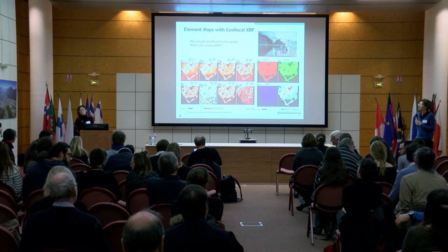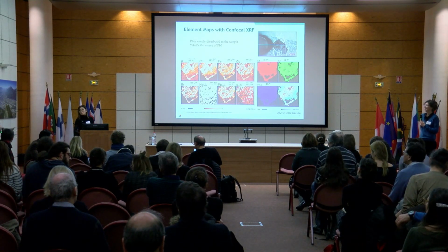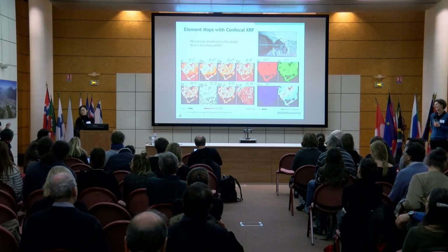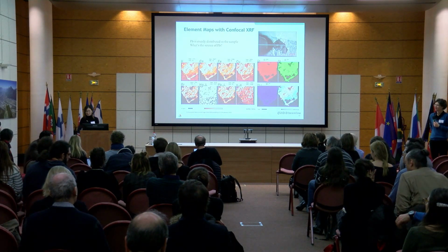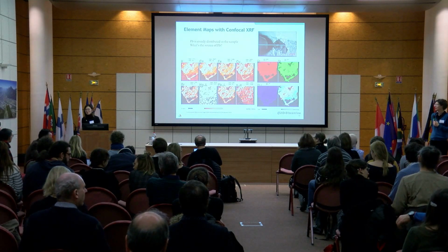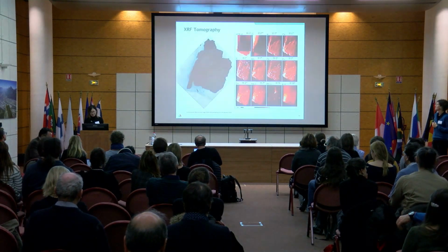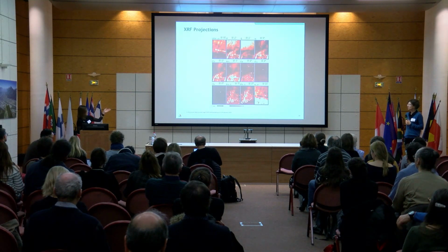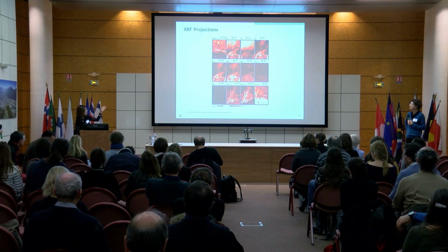It looks to me we have all possible explanations: lead everywhere, almost no contrast, a bit of lead. Probably it depends on the time. Well, there is contrast sometimes, like this one. It's quite obvious, right? You see this letter stand out in the lead map in comparison to the other elements.